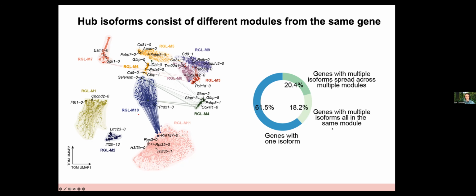So honestly, out of the isoform data, almost nothing is highly expressed like you would think of it in the short read single cell data. So I don't know, I think it's still pretty interesting. There might be a more optimized way to do it for this single cell long read data, but this is a very new data modality essentially.